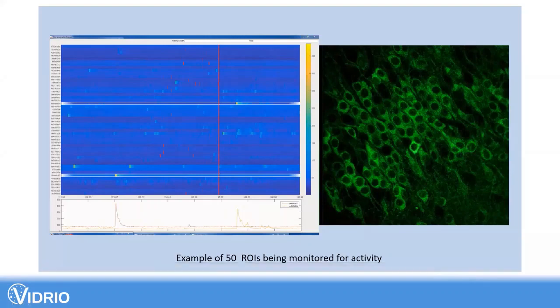You can use that region of interest type of interface, or you can define your own mask, if you have a way of segmenting the cells, or you want to load in a mask that tells you exactly where you want to monitor, et cetera. So John, you want to take it away again? Sure, thank you.